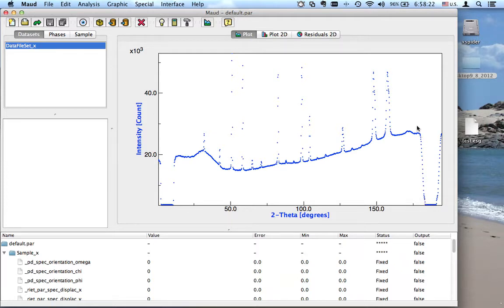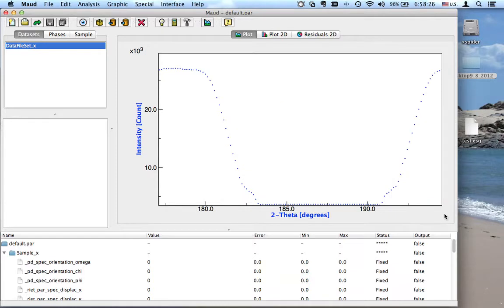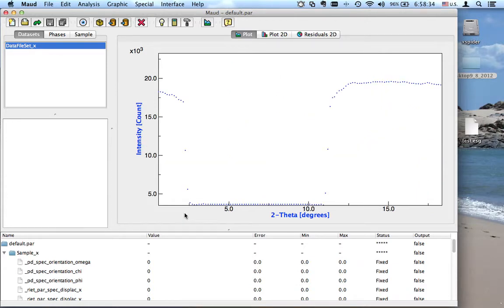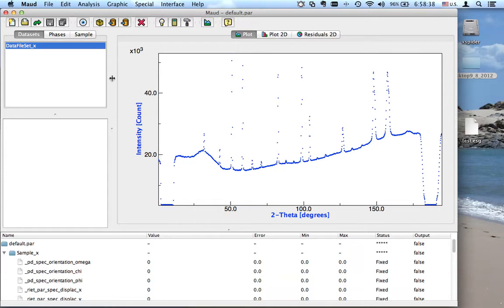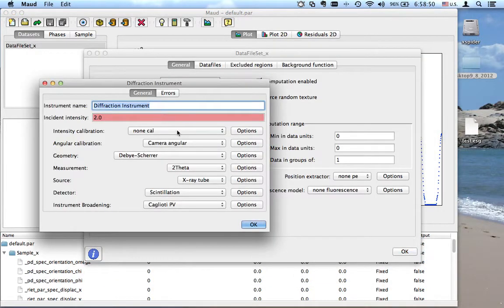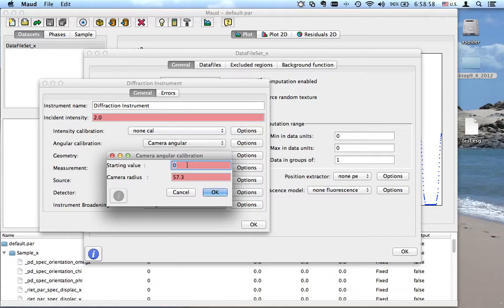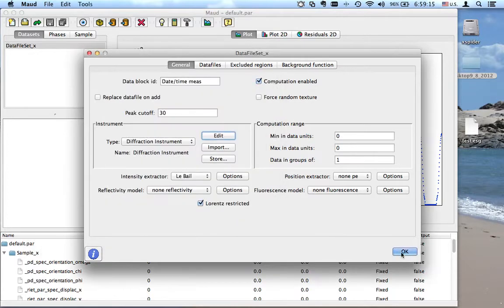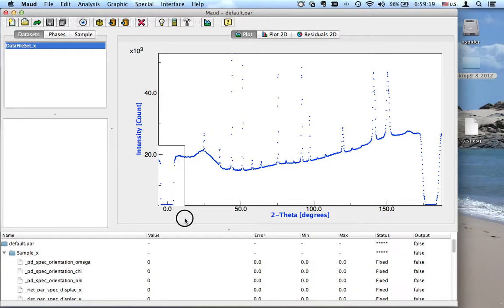You see we are at the top, it's not at 180, because we are not at zero — we integrated starting before the hole. So we need to correct that in the instrument. Remember, X was 7.03. So in the camera angular calibration, the starting value is so that the starting point of integration was at minus 7.03 mm. You put exactly the reverse of X. Now you see we are around zero here.